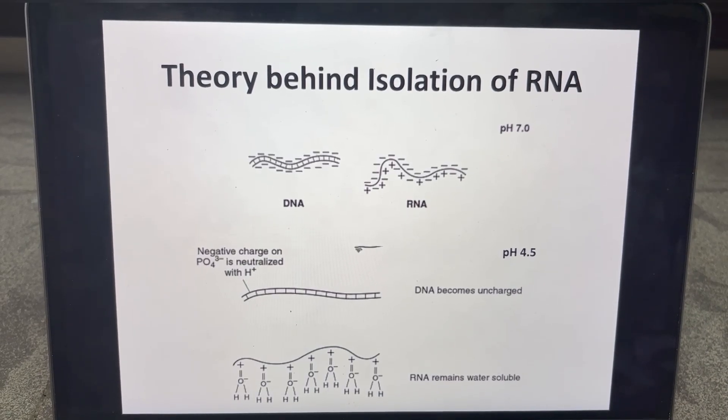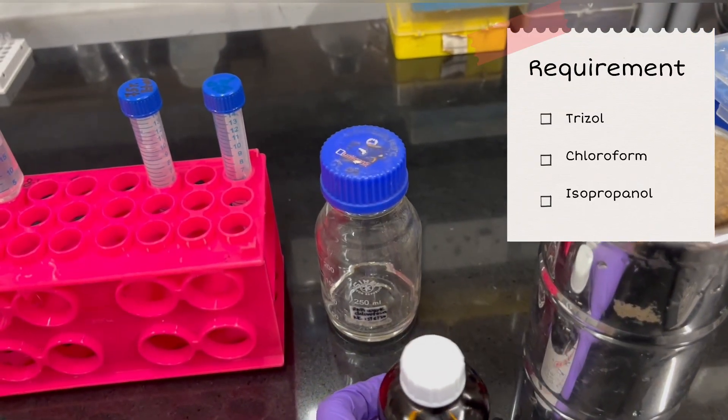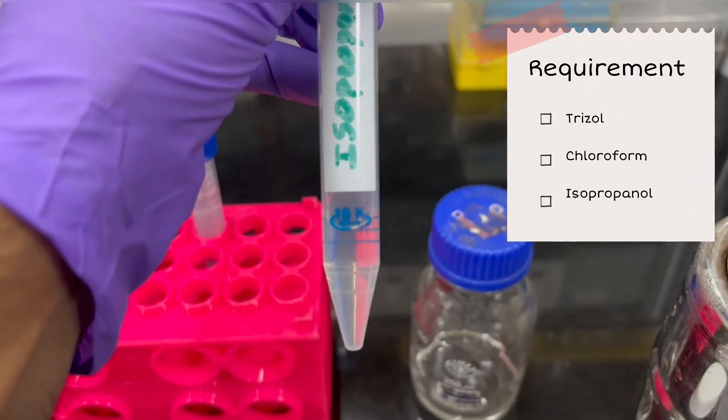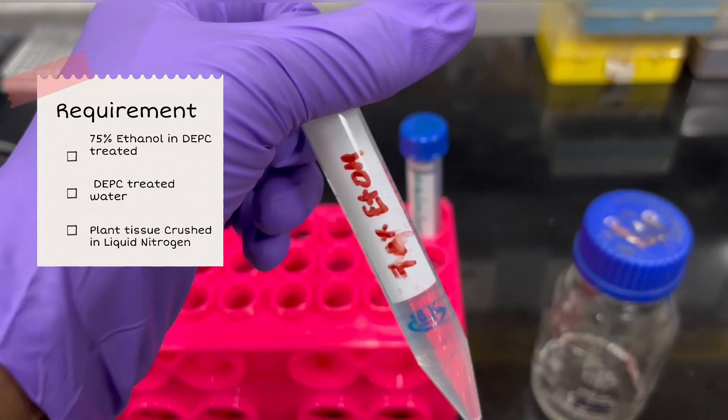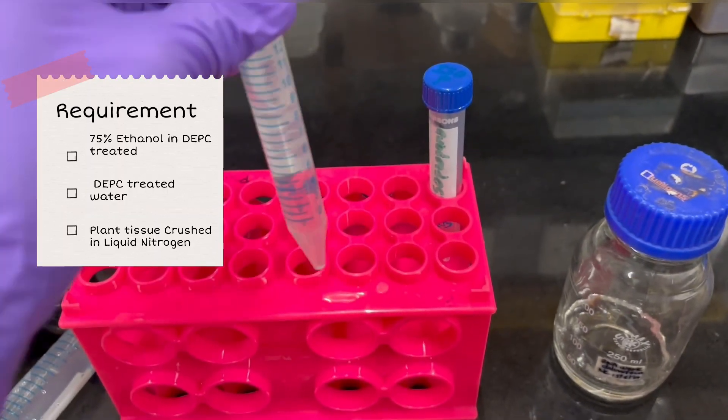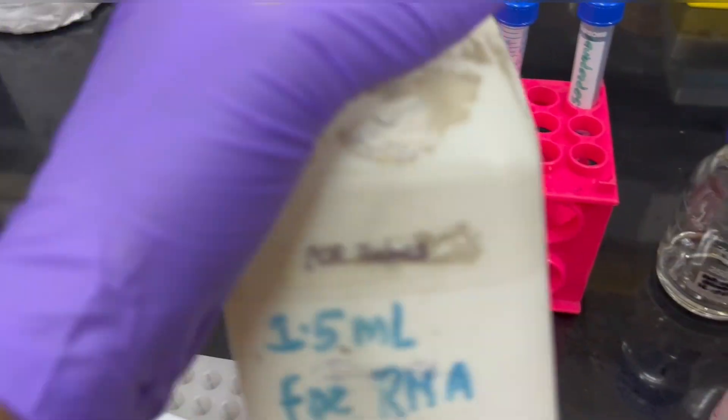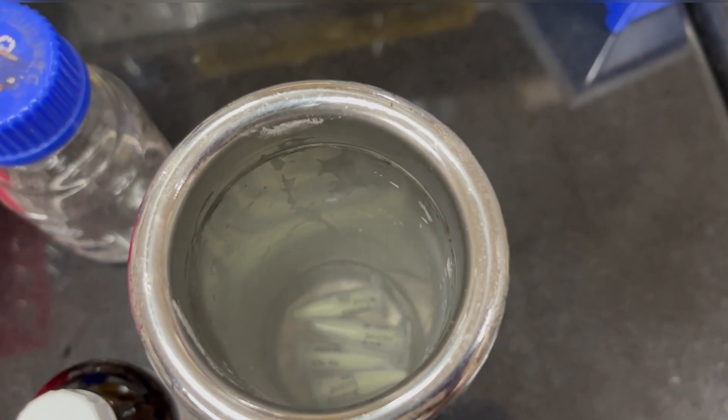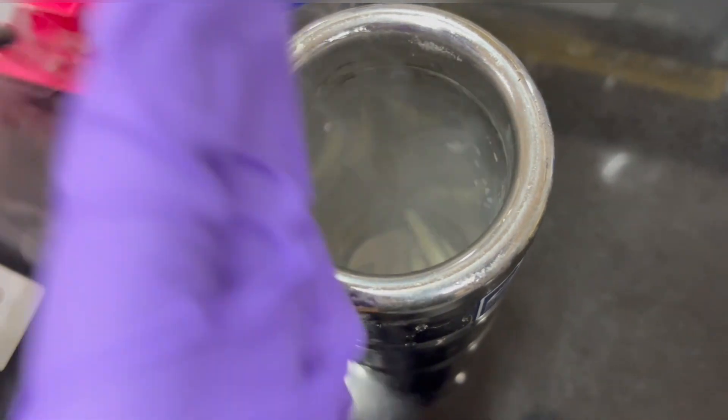Now we will start with the practical demonstration. If you have any doubts, please let me know in the comments. So we need Trizol reagent, we also need chloroform, and we need isopropanol. I have aliquoted from the main stock and kept it with me. Also we need 75 percent ethanol which I have prepared in DEPC water. So remember, 75 percent ethanol should be prepared in DEPC water and last we need DEPC water. We need deep end-up tubes that I have autoclaved. We need pipettes as well as we need tissue from which we are going to isolate RNA. Previously I have crushed the leaf samples and kept it in minus 80.